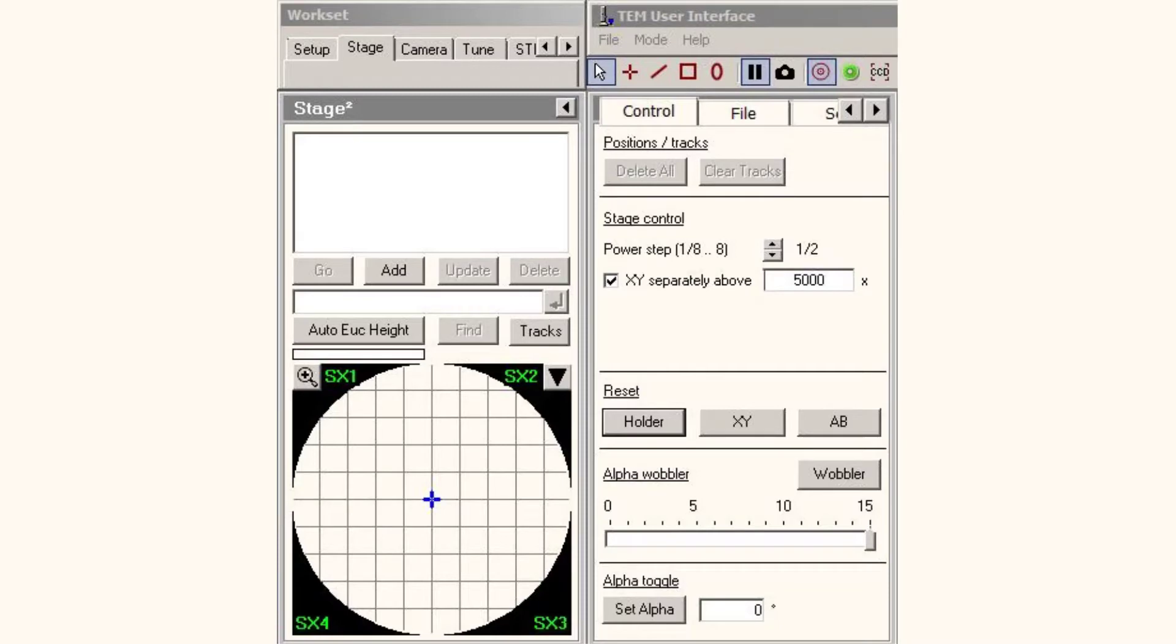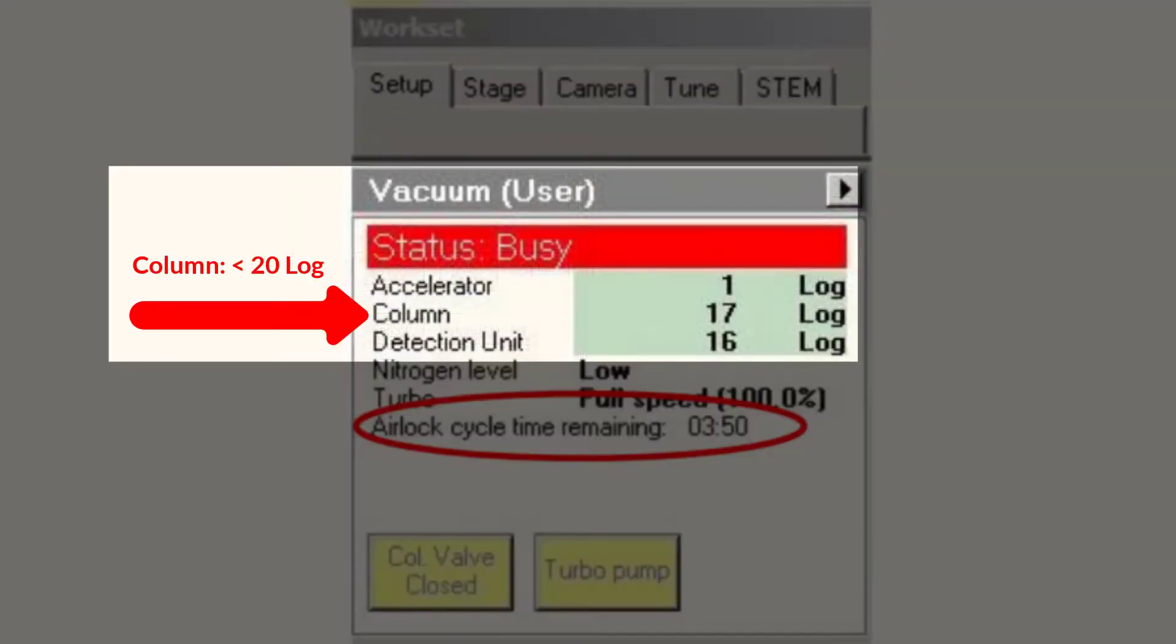Next, navigate to the Setup tab and check that the vacuum for the column is at 20 log or lower. This is critical. Opening the valves at pressures higher than this will lead to contamination of the field emission gun and shorten its lifetime.